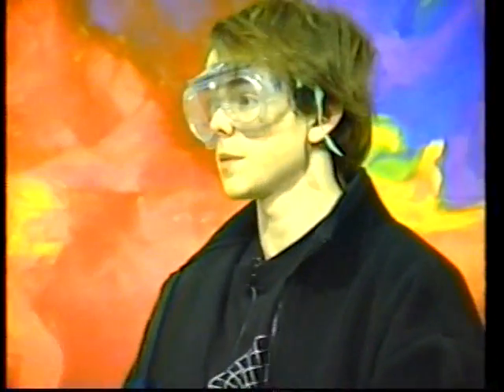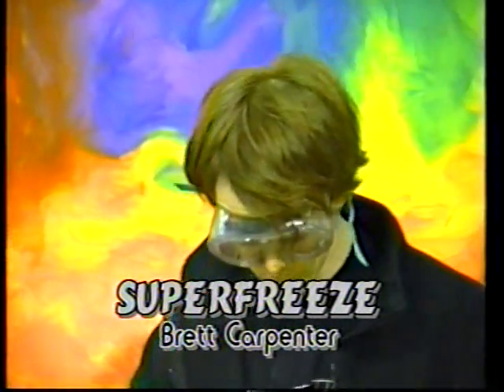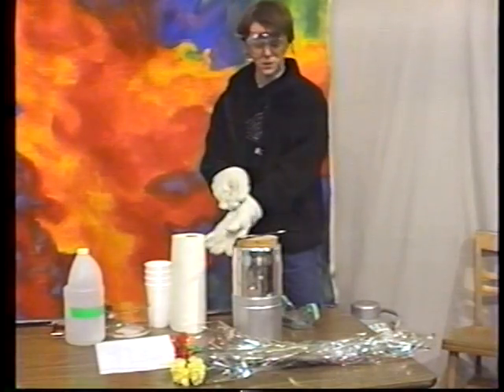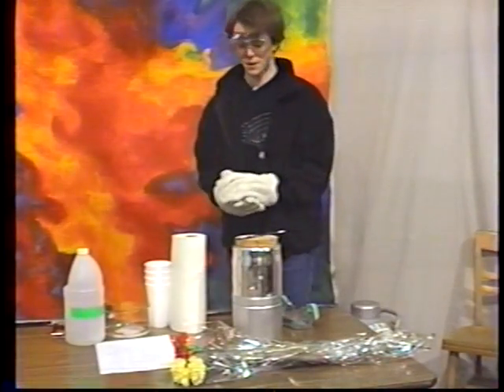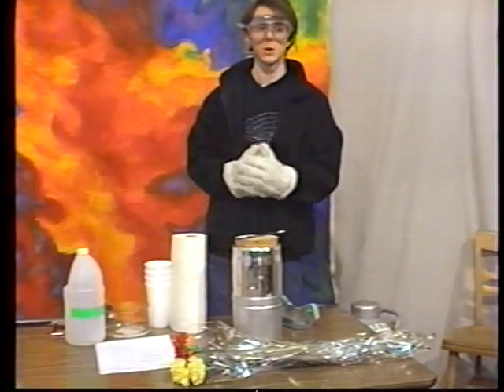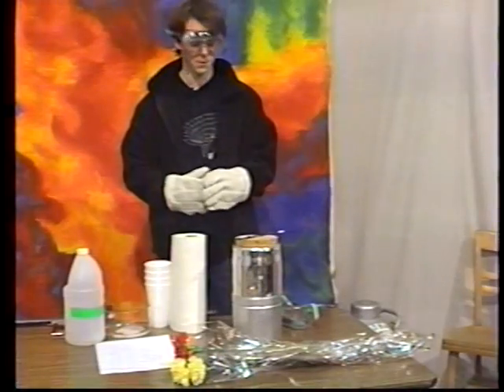I'm Brett Carpenter, and I'm going to show you a little demo with liquid nitrogen. Now, liquid nitrogen is below negative 200 degrees Fahrenheit. So, as you can figure out, it's pretty cold. We're going to show you what this liquid nitrogen will do to a couple common everyday materials.